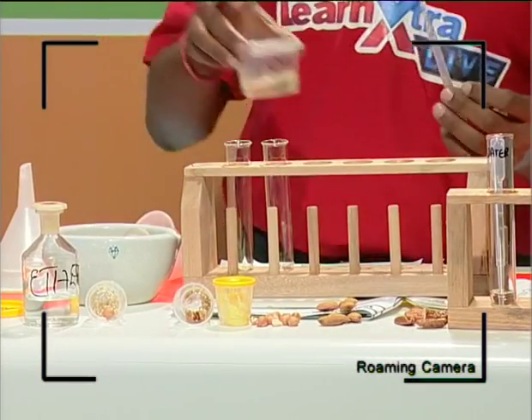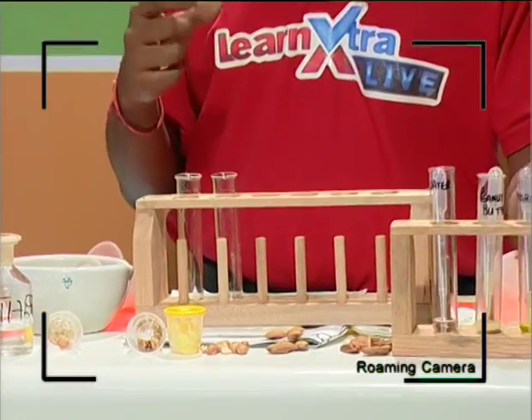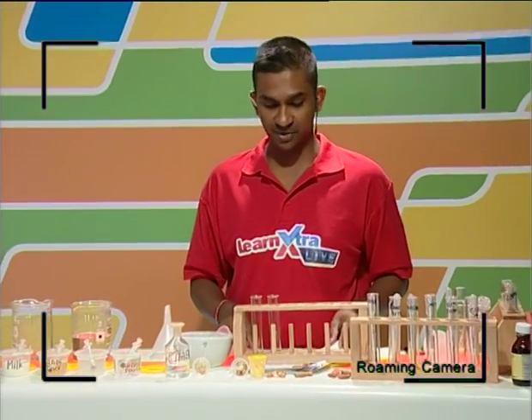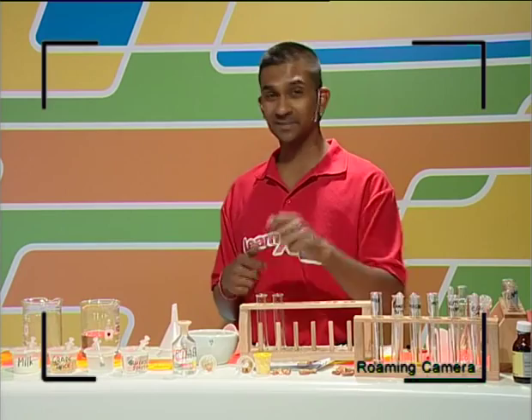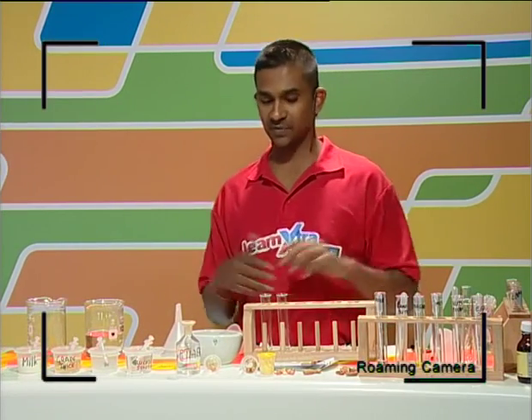Remember that I said this is not a color test, this is an emulsion test, so we're going to look at droplets, and it's very simple. I'm sure you remember, probably while having lunch over your studies, you dropped a crumb or a piece of bread on your books, and you often end up with an oil stain, and you submit that assignment and your teacher says, wow, you've been having lunch with your work. Essentially that's what we're going to do today.